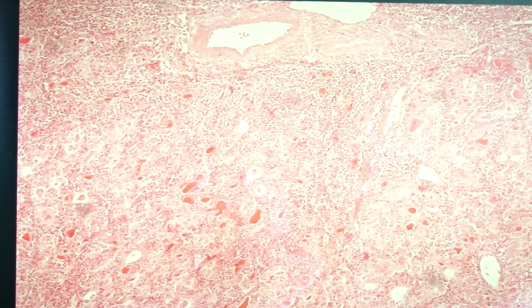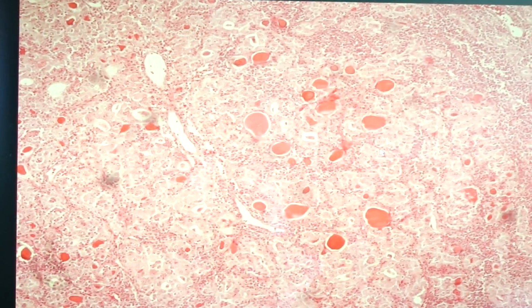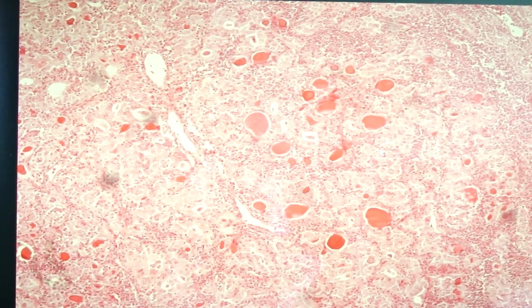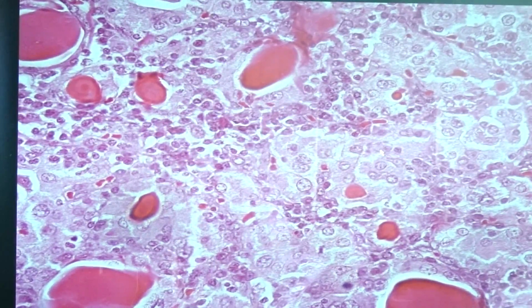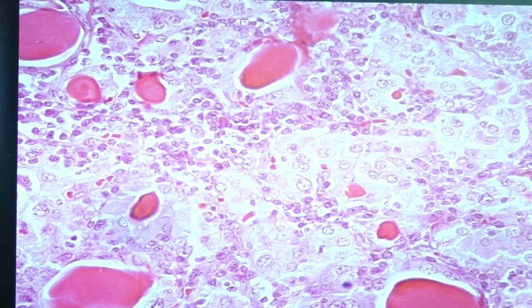And then with regards to the follicles here, they can present as atrophic or as metaplastic. Okay, so the metaplastic follicles would be lined by cells that are larger than usual. They would possess a larger round nucleus, and then they have granular cytoplasm.